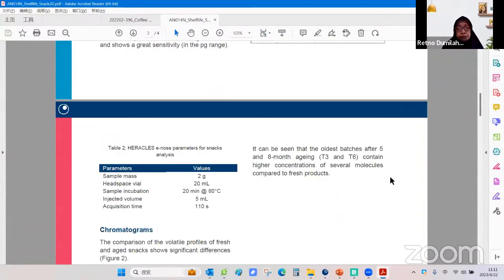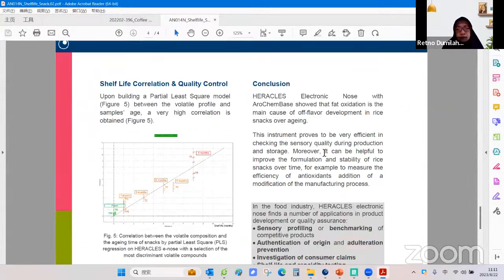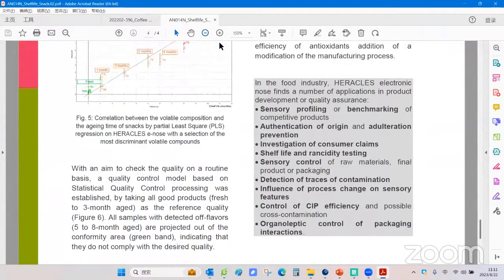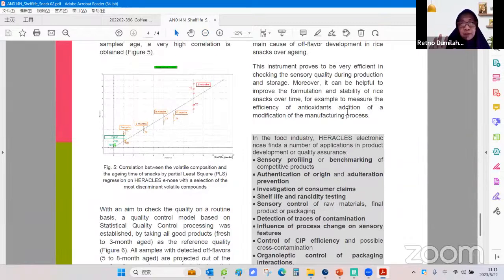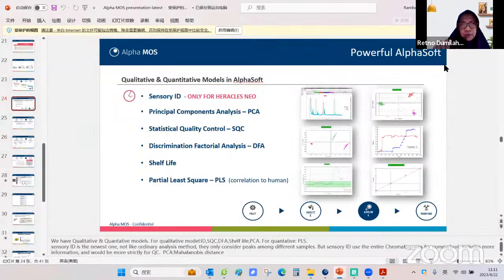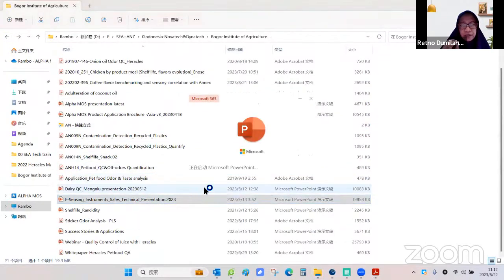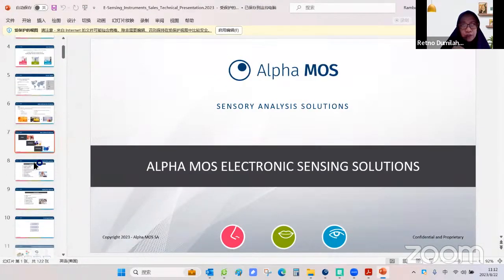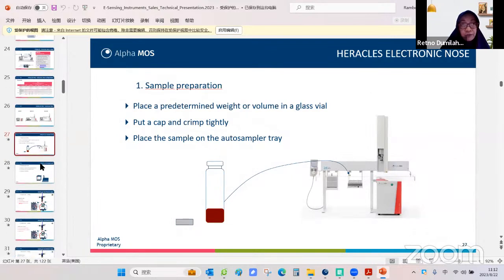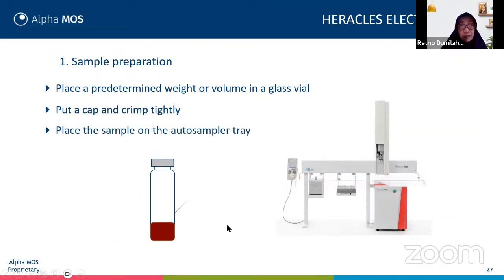I'm sorry to ask again. Well, do we need to process the sample before it is injected or introduced to the instrument? What I mean to say, is it mentioned together with the instrument, is there a method? There is a procedure or guidance on how we should process the samples before going into the instrument. Is it available with the instrument? The procedure on how we should process the sample.